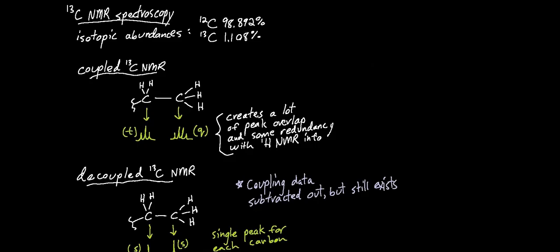Onward to carbon-13 NMR spectroscopy. We're lucky in proton NMR that the most abundant isotope is the one that's also visible in the proton NMR spectrometer. That's not the case with carbon. The visible isotope of carbon for NMR is the less abundant, although, as it turns out, it's just abundant enough to see carbon-13s represented in all the atoms of a molecule in a mixture because there's so many molecules in that mixture.